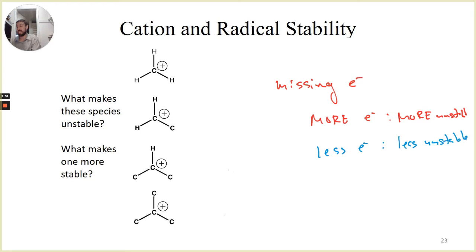And around that first carbon, we've got 6. The second one has 6. The third has 6. The fourth has 6. You go, well, they all have the same number of electrons, Mike, so your argument is invalid. They have the same number of electrons in the bonds immediately next to the carbon. But just like when we did R and S, okay, we first look close, and then we stepwise look further and further out. And when we look at all 3 of these, we'll notice that yes, they may have all the same 3 bonds, but does that mean they're all identical?